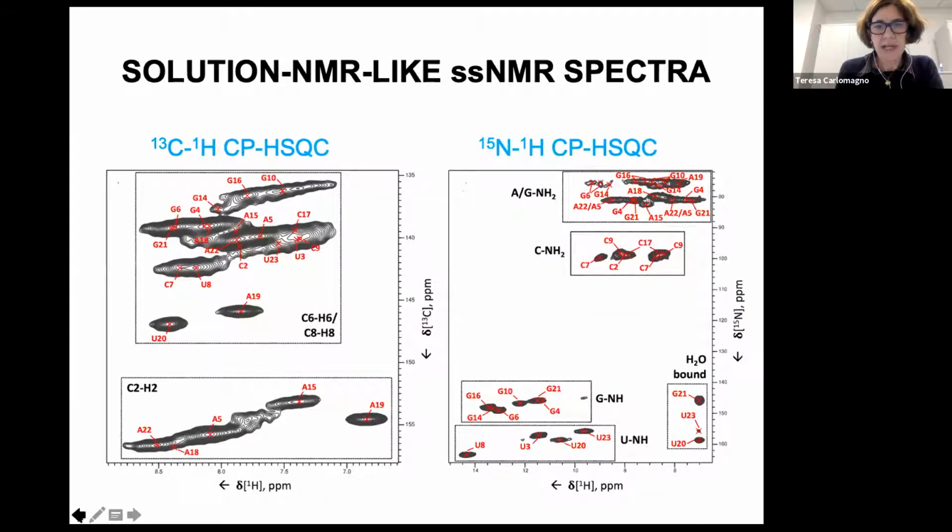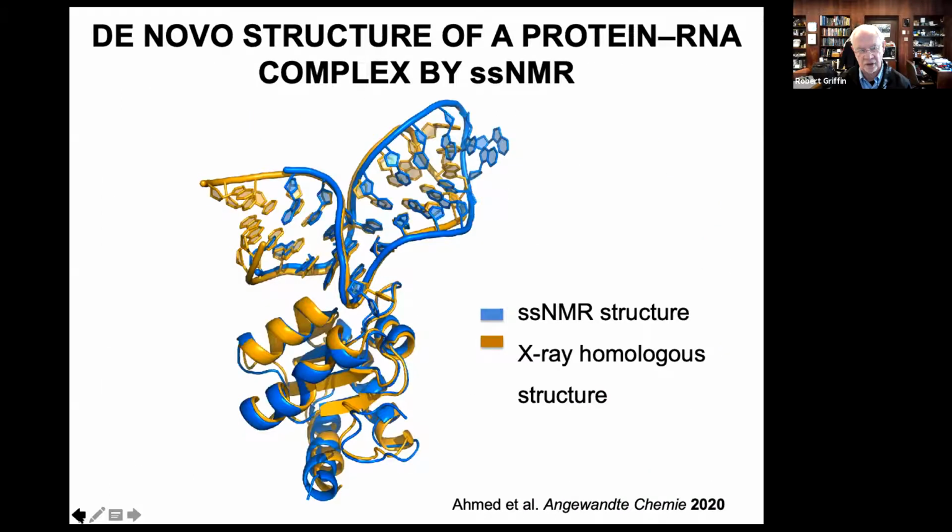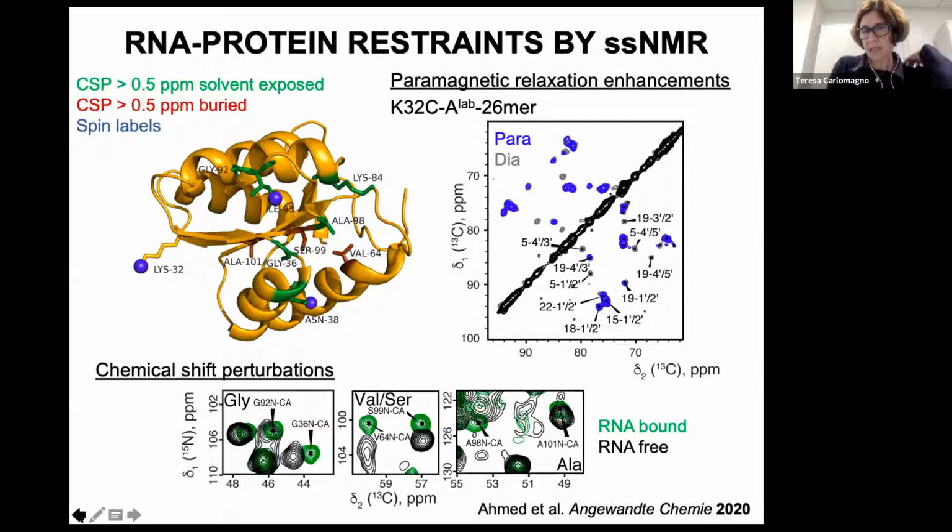They are not so close, carbon and nitrogen. The closest that they are is about 3.5 angstrom. So yes, you do see some, but it's better to go with nitrogen, and for sure better to go through the protons that are in between. Oh, with the protons, that's another approach. But the problem with solution NMR is you've really got 1 proton or so on each of the bases, times 2. So there are not a lot of constraints in the proton. Yes, in the NOE spectrum, and that was always an issue.